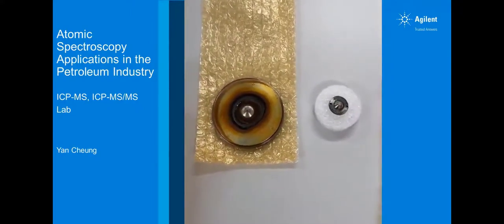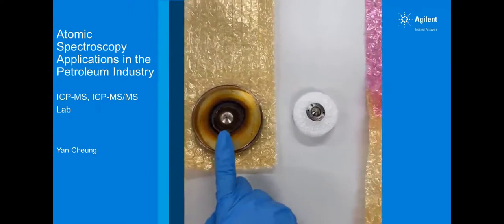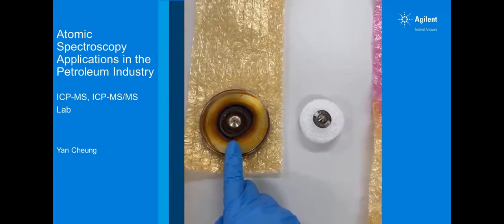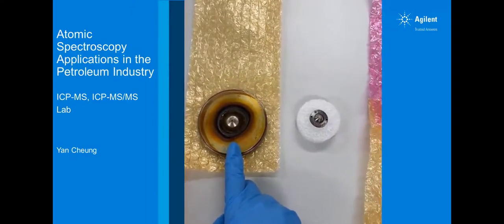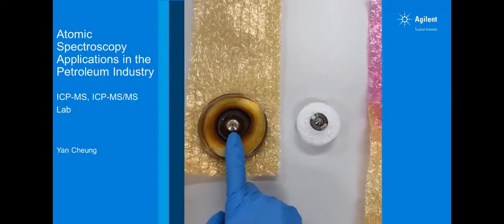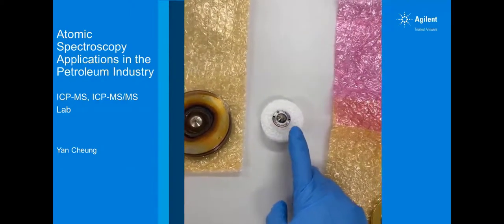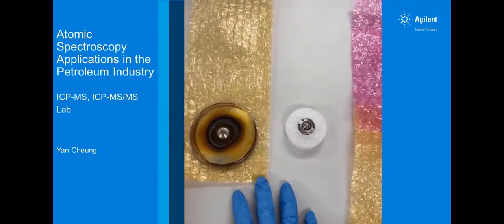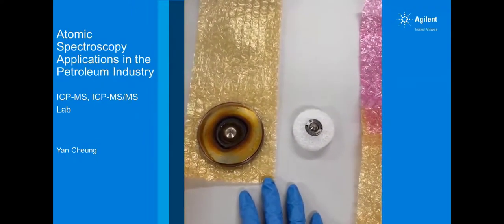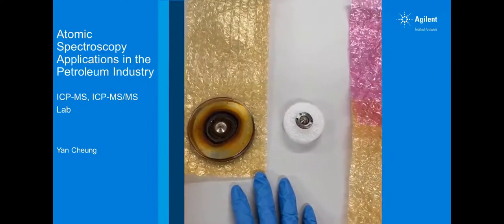Now moving on to the cones and lenses. For the organic solvent introduction, it's recommended to use a sampling cone with the platinum tip, as well as the skimmer cone with the platinum tip. The reason is that the platinum tip will be able to withstand the higher temperature of the organic plasma.